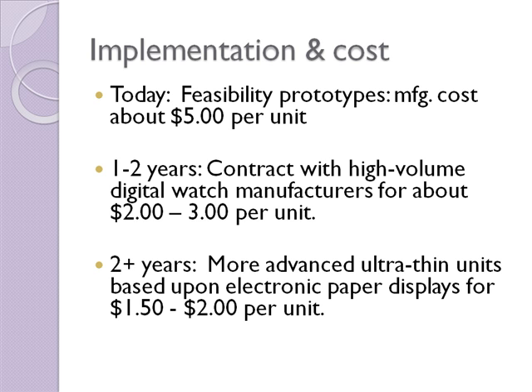And it's easy to see how one of those could be converted into a LifeTrack type unit with a slight microprocessor change and a little programming change. By the time you had sufficient validation, I'd estimate these things to be made for about $2 or $3 per unit. It would look like a little digital watch, but it's not a digital watch, it's a miniaturized LifeTrack unit. It goes on the carton.